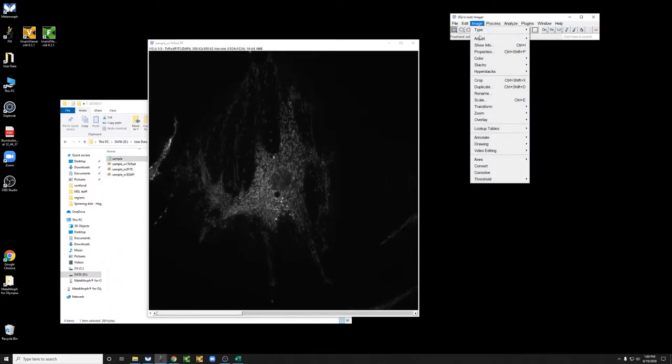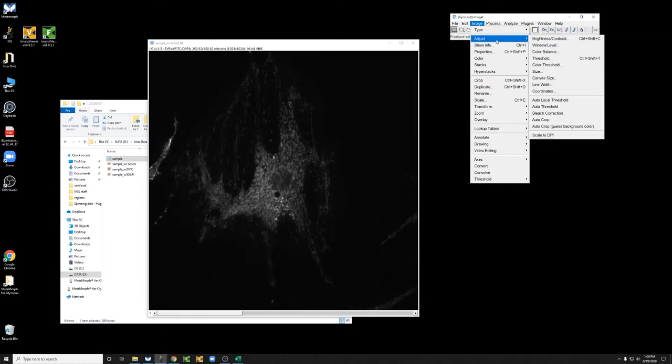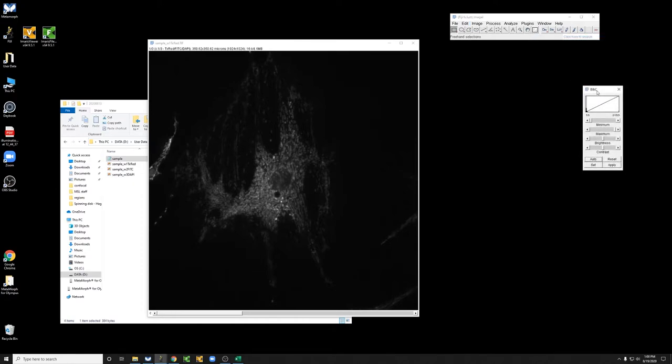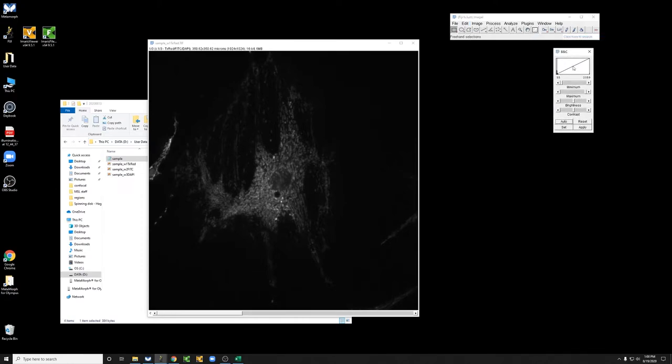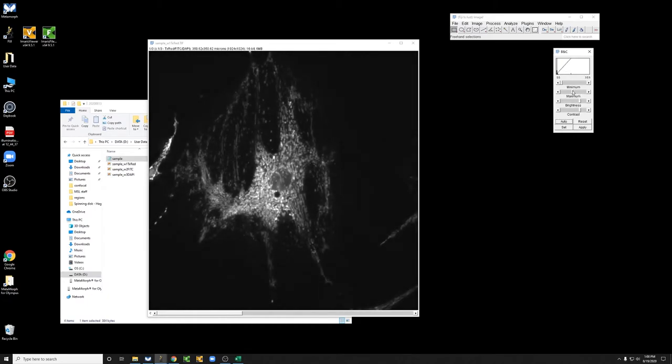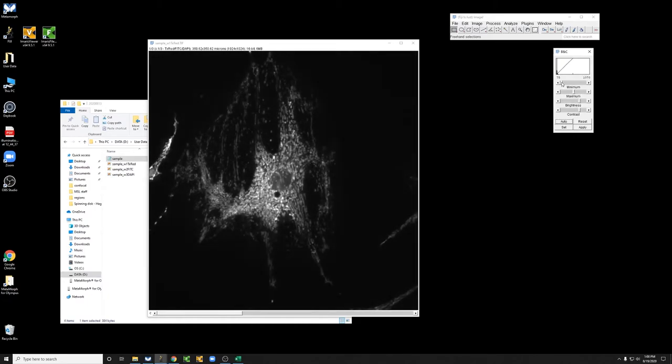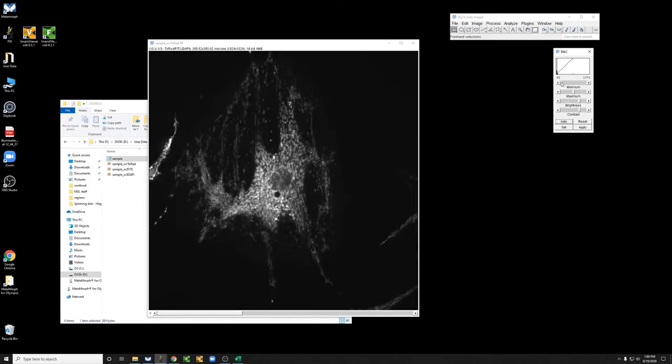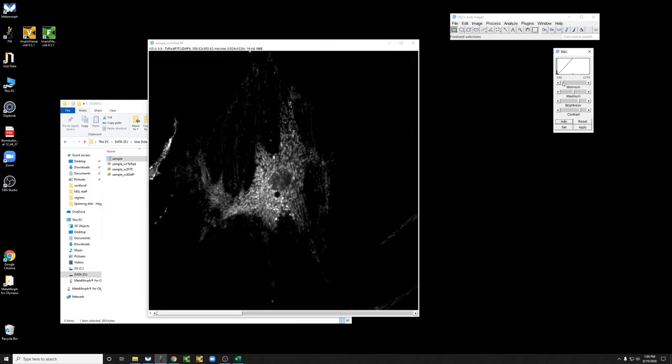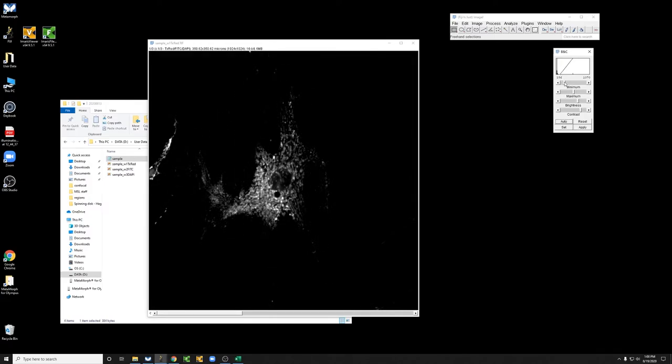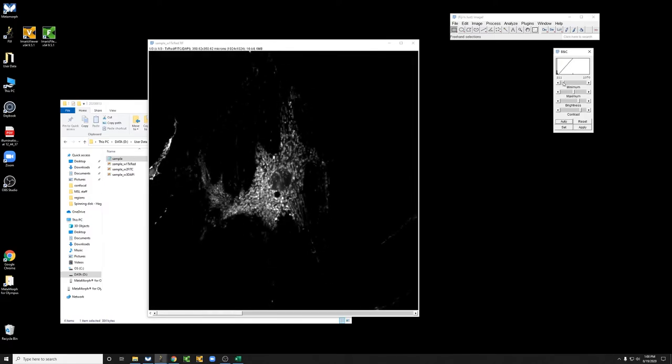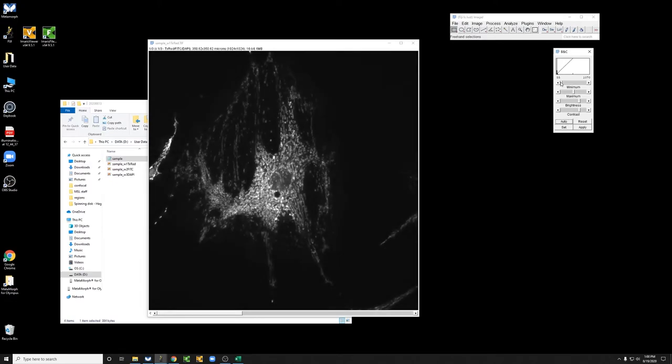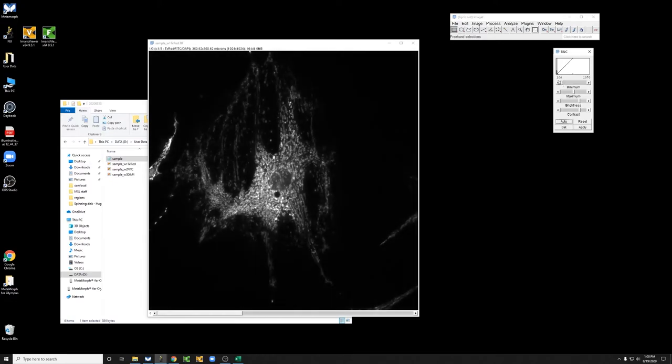The two typical adjustment things that you can do are brightness and contrast. If you move the maximum to the left, things get brighter. If you move the minimum to the right, you can cut down on the dimmer pixels, though you can go overboard and have a very misleading view of your sample, so be careful that you don't do that.